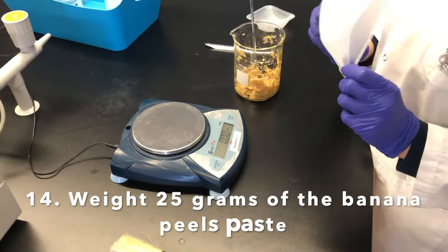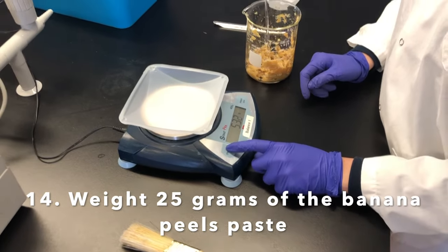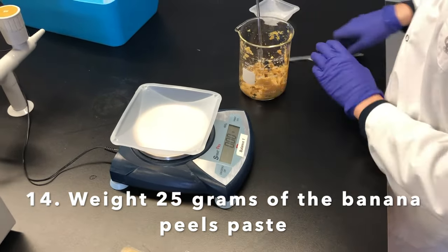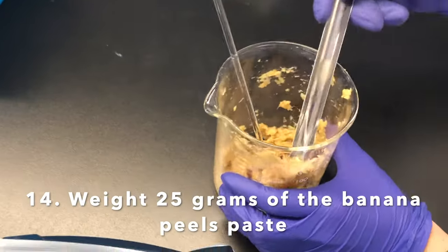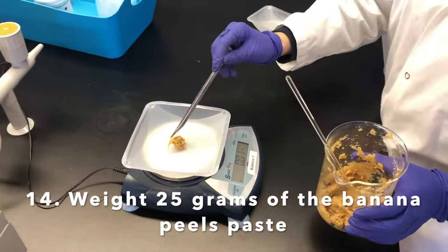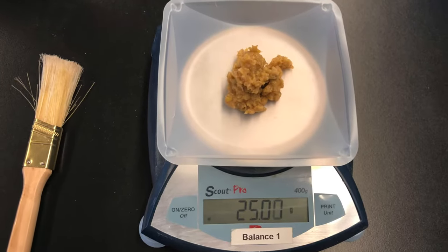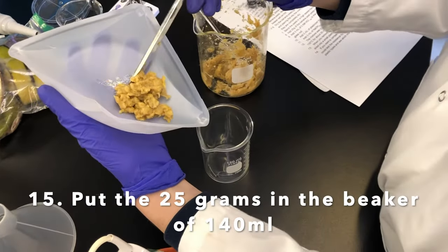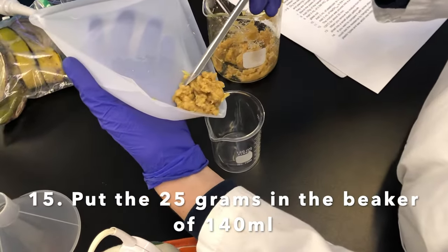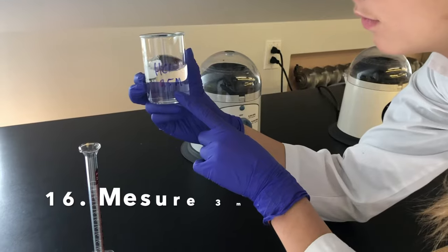First we're going to tare the weigh boat and then zero the balance. We're then going to weigh 25 grams of the banana paste that we just made. Emily is going to put the 25 grams of banana paste into the 140 ml beaker.